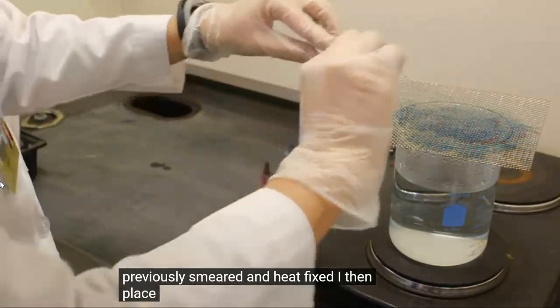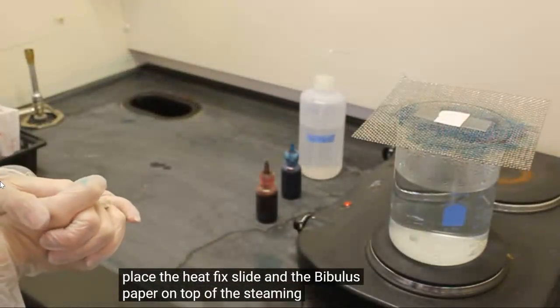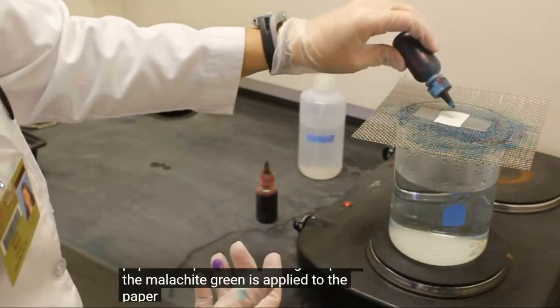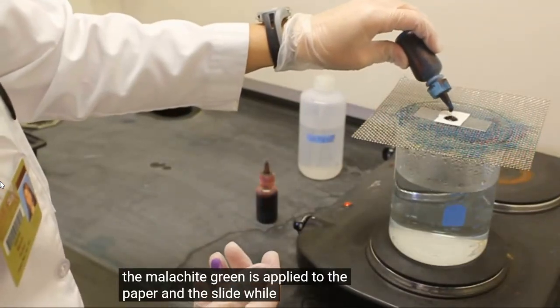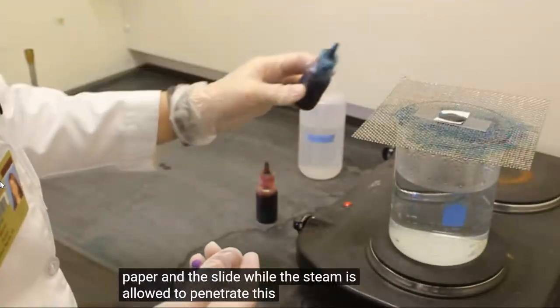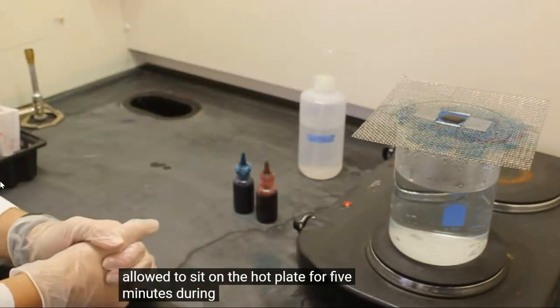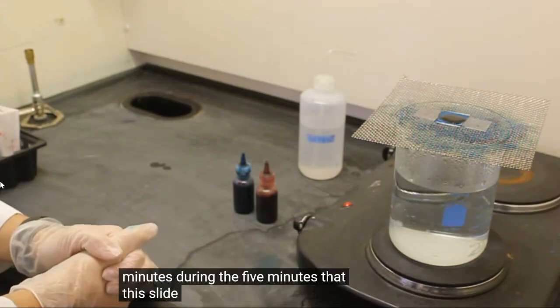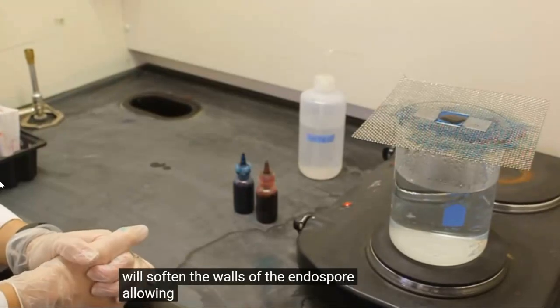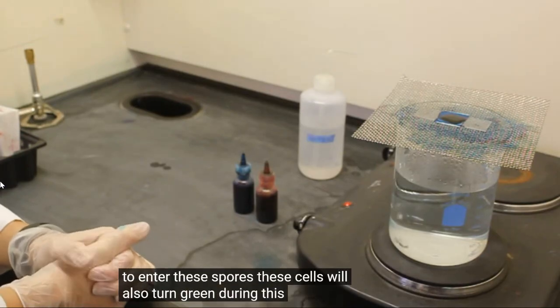I then place the heat fixed slide and the bibulous paper on top of the steaming hot plate. The malachite green is applied to the paper and the slide while the steam is allowed to penetrate. This must be allowed to sit on the hot plate for 5 minutes. During the 5 minutes that this slide is on the hot plate, the steam will soften the walls of the endospore, allowing the malachite green to enter the spores. These cells will also turn green during this 5 minutes.